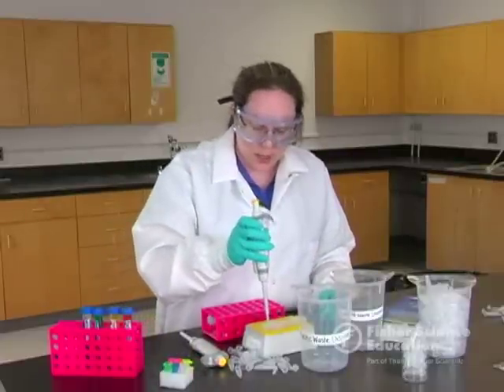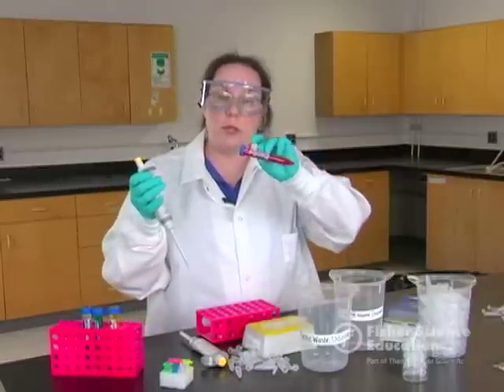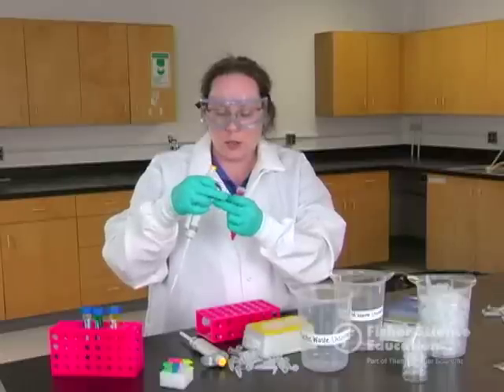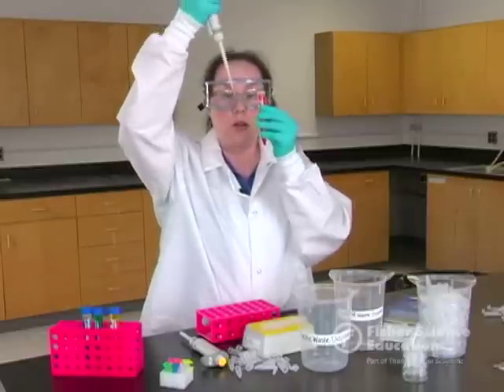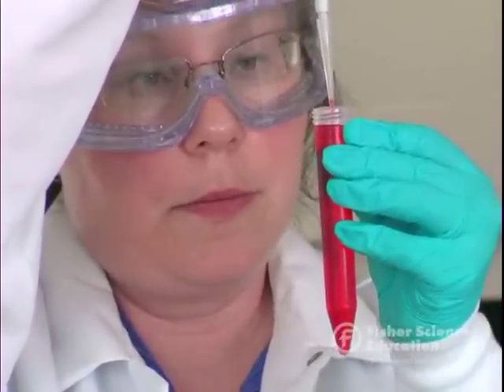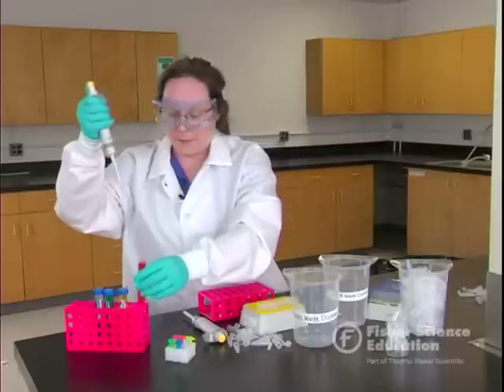Always use a tip on your pipetter. I teach my students with food coloring — it's a very inexpensive way to get color into your lab. Go to the first stop, and always pipette at eye level. This is the pipetting zone. The tip needs to go just under the surface of the liquid, and at eye level slowly release from the first stop up to draw your sample.